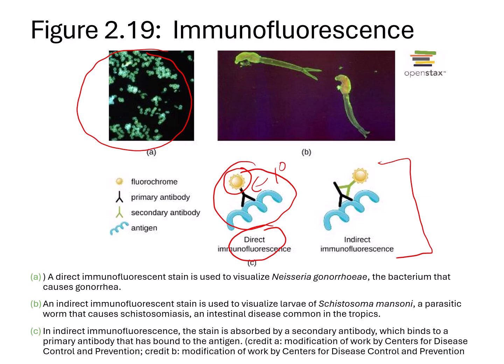Here is indirect immunofluorescence. The primary antibody is the black one, and that's not labeled. If you only had that one, you wouldn't see anything under the microscope. But here we have a secondary antibody that does have a label, has a fluorochrome. So if the secondary antibody binds to the present primary antibody, you'll see the color appear.